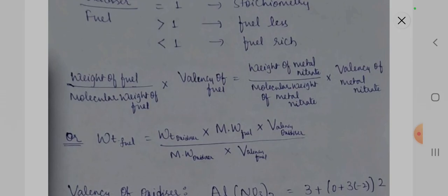Here in this video I'm using aluminum nitrate, so I'm doing the calculations for aluminum nitrate and the fuel sugar. You can use other metal nitrates, for example zinc nitrate can be used to produce zinc nanoparticles, or lead nitrate can be used to synthesize nanoparticles. And for the fuel in this experiment I have used sugar, but apart from sugar you can use urea or glycine. If we are doing the green synthesis method, in place of sugar, glycine or urea, you can use aloe vera gel or lemon, so any plant product that contains carbohydrates, carbon and hydrogen can be used in the solution combustion method.